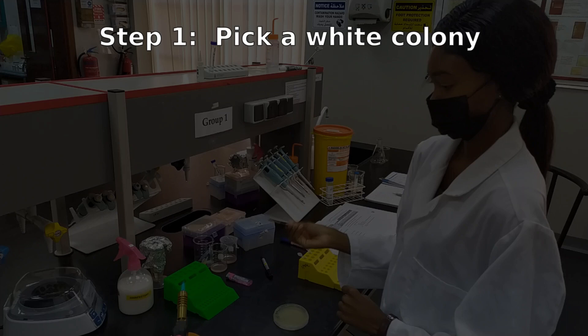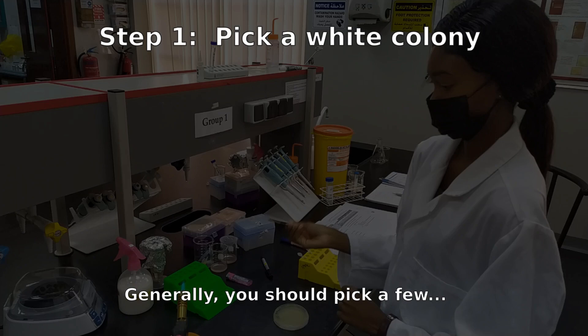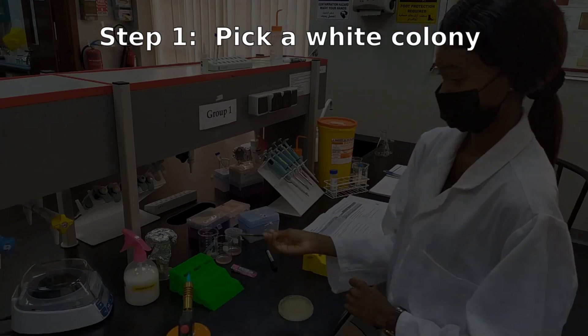As the name suggests, you need to start with a colony — at least one colony. But in our case, you'll pick at least two. When picking colonies, you'll be using your inoculating loop. You need to make sure that it's sterile.